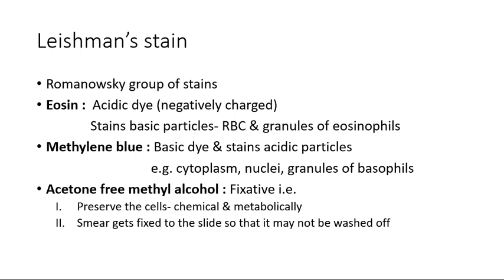This is a very important caution asked in exams: what is this acetone free methyl alcohol? It acts as a fixative, and that's why it is acetone free, guys, because if acetone were there, it would not preserve the morphology. It will destroy the cell. So what does the word fixative mean? It preserves the morphology of the cell chemically and metabolically.